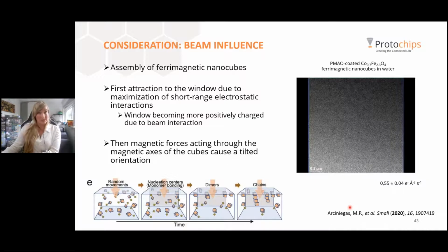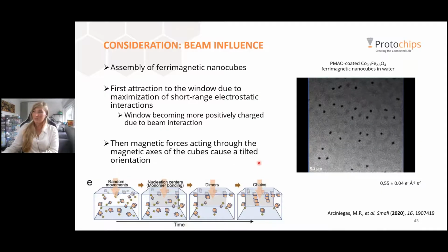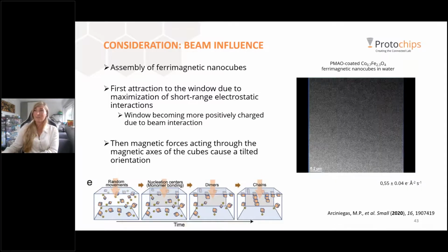I've talked about charge being in some cases a bad thing, but it can also be a great thing because it can use charge and magnetic forces to start lining up particles. In this case, with these cobalt iron oxide nanoparticles, they used the charge of the microscope to look at the particles. They came from the liquid and went to the window and even formed these chains because there were magnetic forces acting as well. It's a very interesting paper too if you want to look at self-assembly of different kinds of nanoparticles.